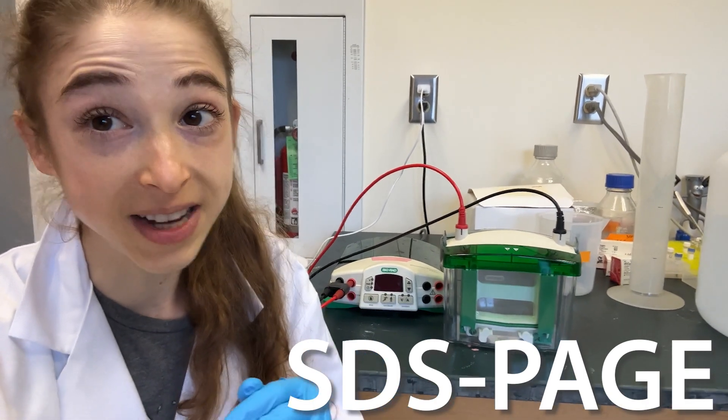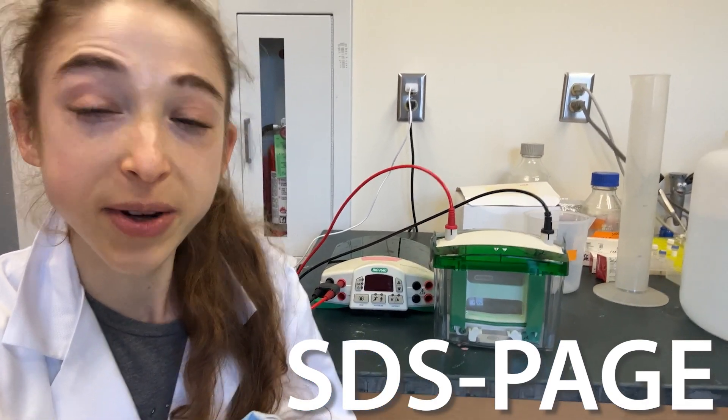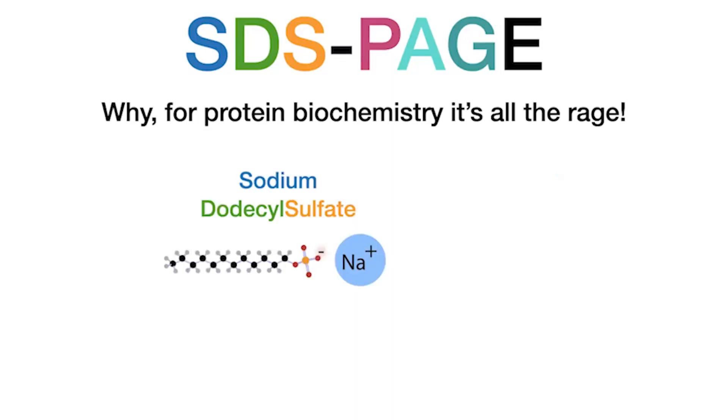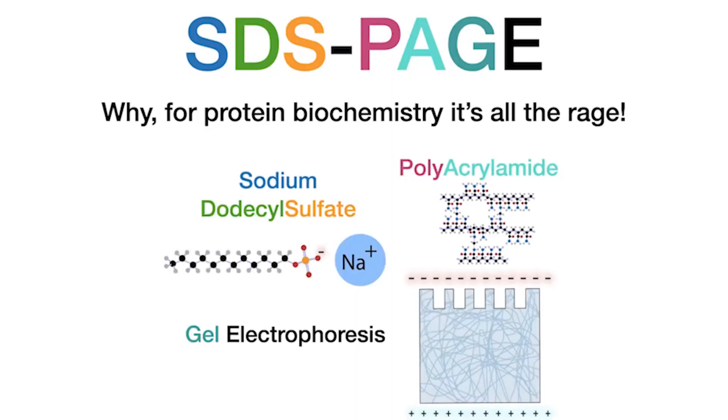SDS-PAGE is one of the most fundamental techniques you'll do in biochemistry, so here's an overview of how it works. SDS-PAGE stands for Sodium Dodecyl Sulfate Polyacrylamide Gel Electrophoresis. There are some really big words, but it's not so bad.